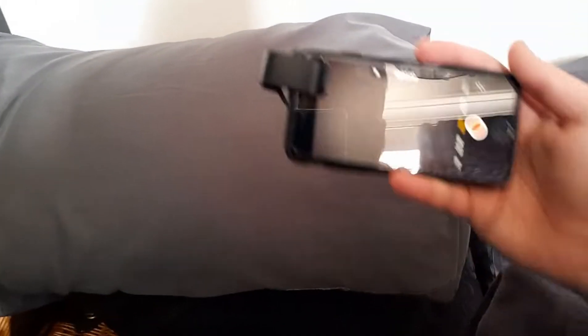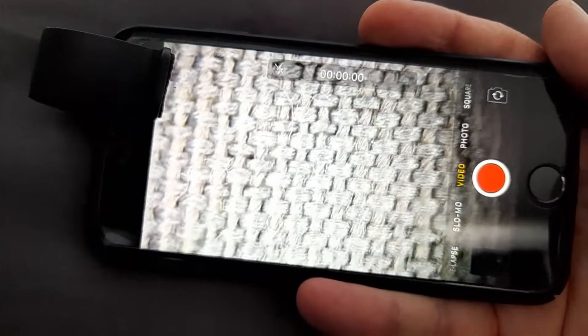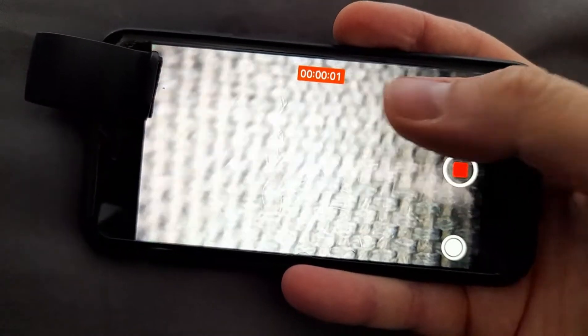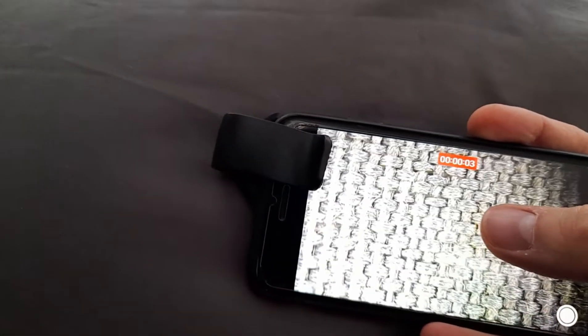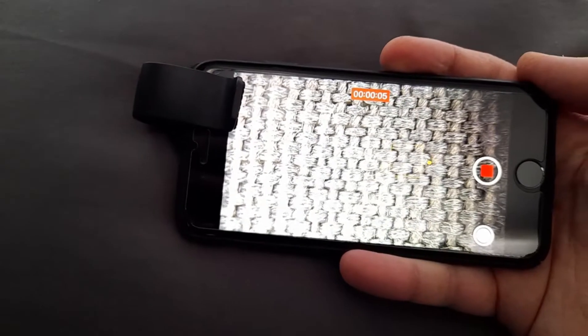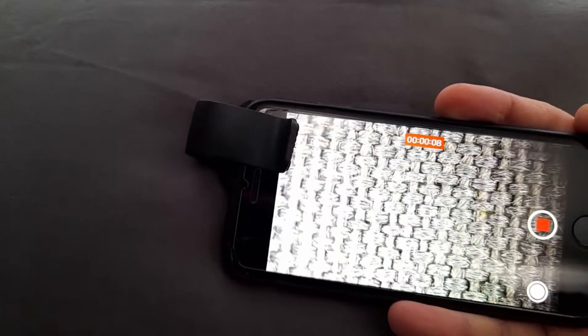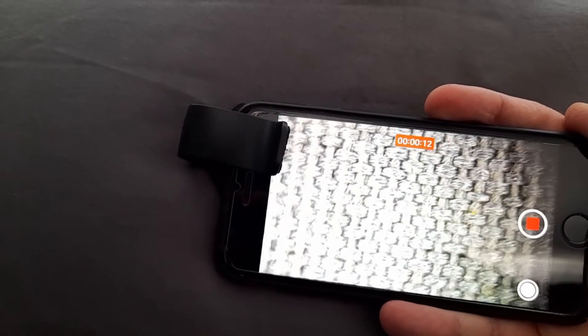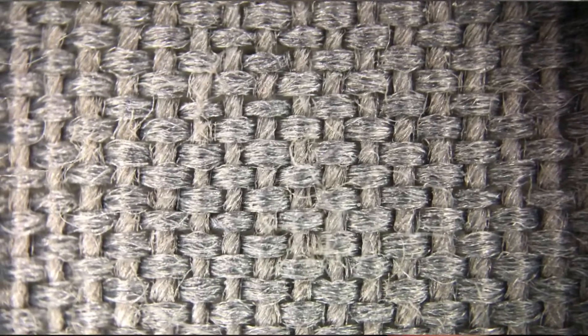This is just a pillow — you can see it's just a normal pillow, and then when you put this on there it shows you the texture of the pillow. Really, really interesting. I'll record that on this phone and then I'll try and actually show you the footage on this phone because it looks even clearer on the actual phone. Really, really clever device.